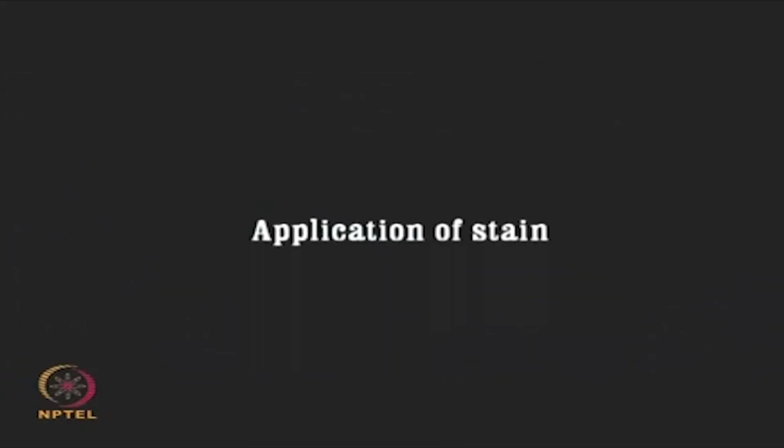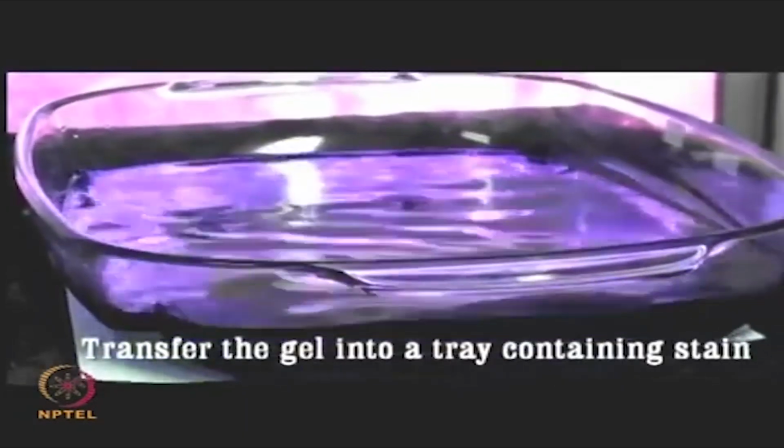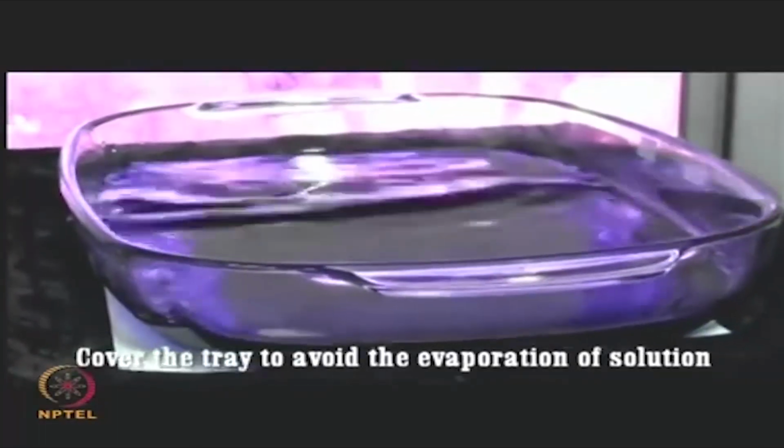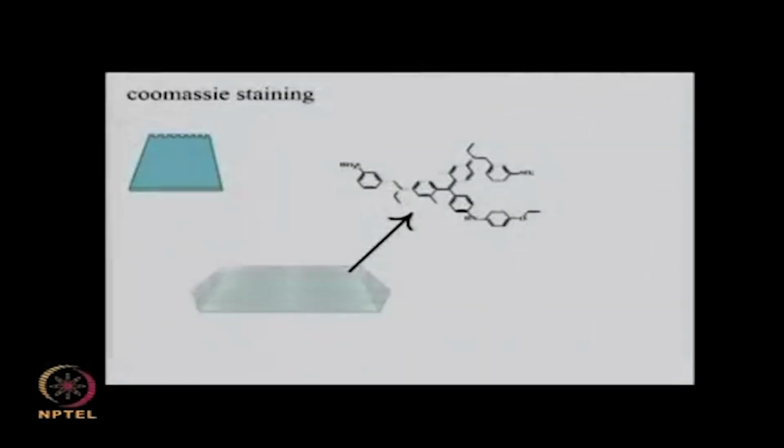Gel staining. Transfer the gel carefully into another tray containing the Coomassie blue staining solution and place it on the shaker to ensure uniform contact of the gel with the solution. The negatively charged Coomassie dye interacts with protein through ionic and other non-covalent interactions, thereby staining them with a blue color.